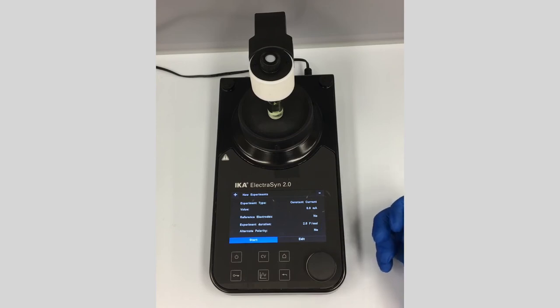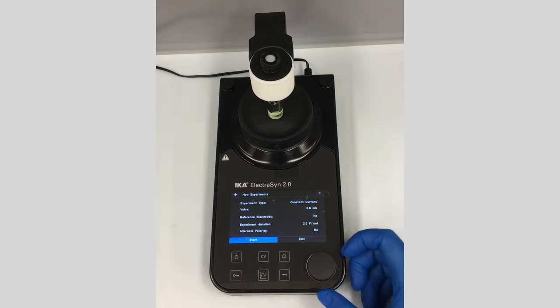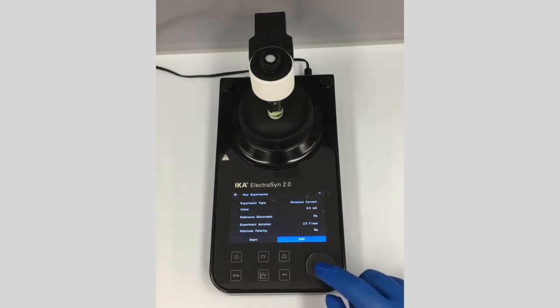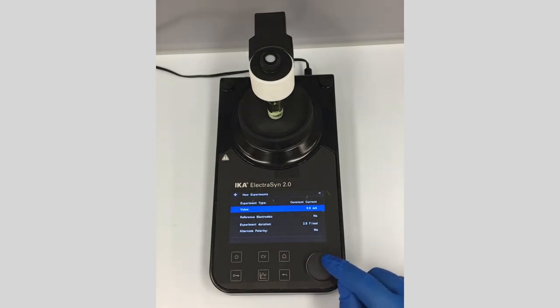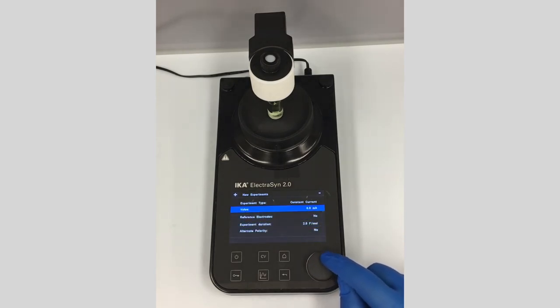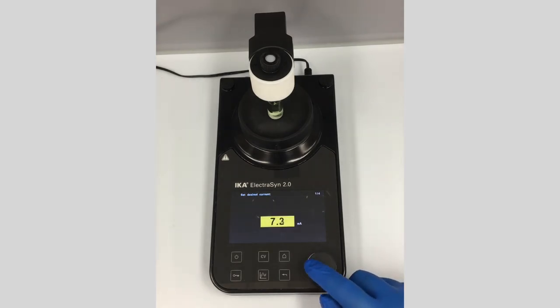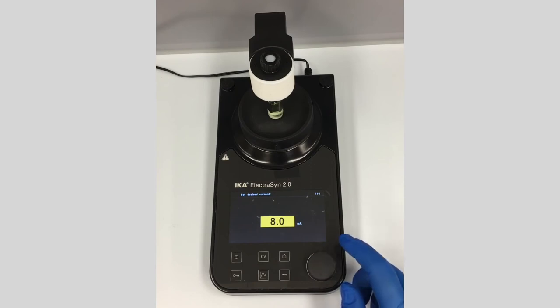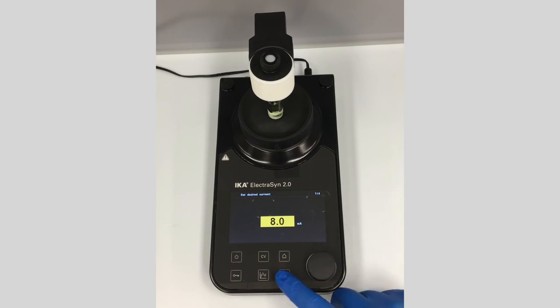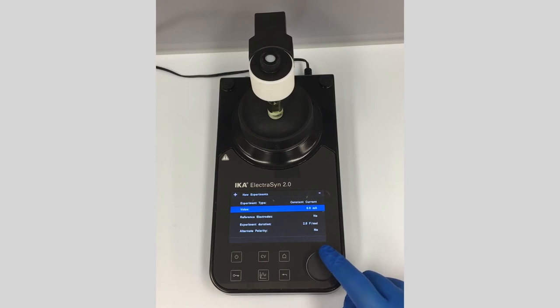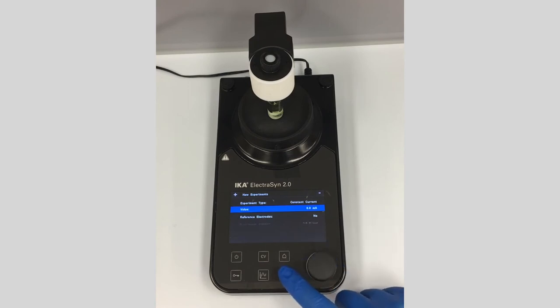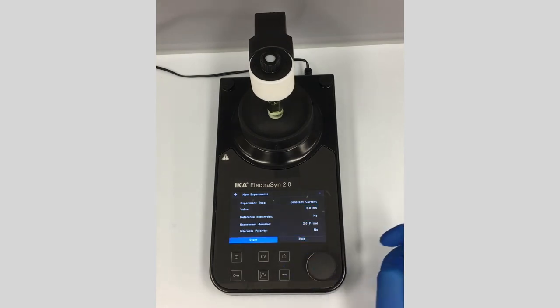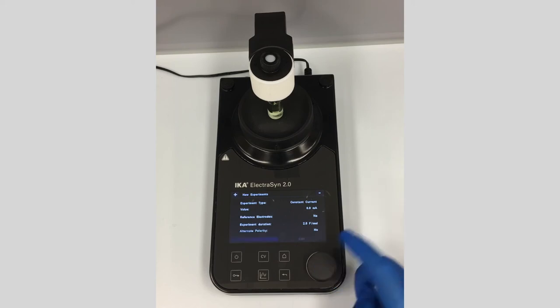We're not going to alternate the polarity. If you did want to edit, you can click the edit button, scroll down, and adjust any of these numbers — for example, adjusting the current up or down. We're not going to change anything now, so we click the back button to get to the pre-reaction running screen and click start.